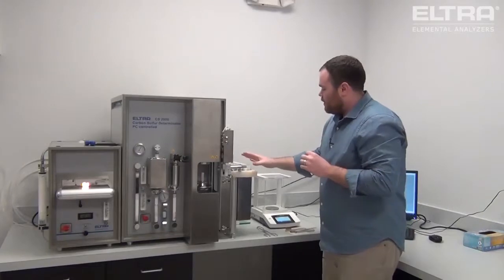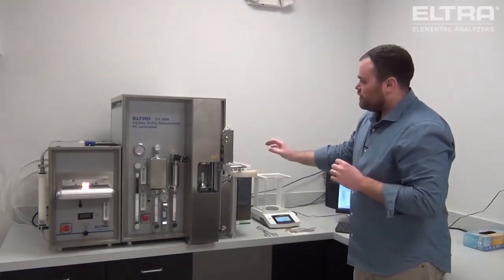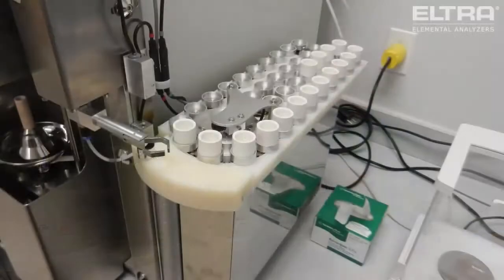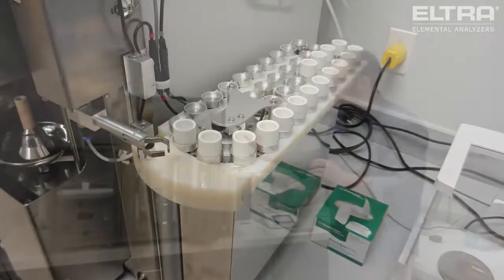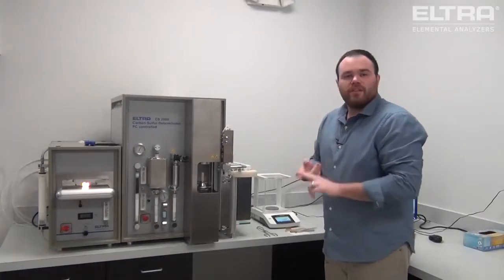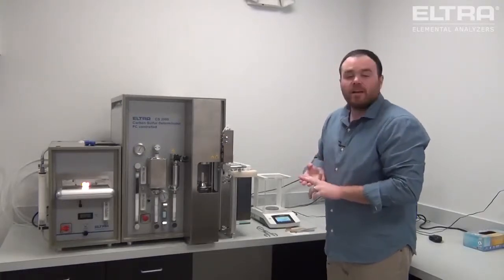We also have the autoloader affixed to the CS-2000. Here we are able to run 36 samples. You are able to run this machine unattended continuously for hours of unattended operation.